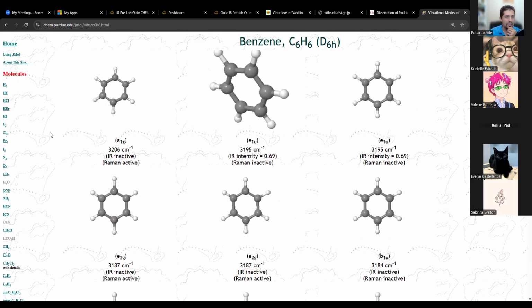It says, does sample phase affect what the spectra looks like, difference in peaks? Sometimes it does, sometimes it doesn't. For example, we're going to see that hydrogen bonding, which happens in liquids, can change the vibrational frequency of the compounds and the bonds. That would be a cool experiment, right? Take an IR spectrum of water in the form of ice and take an IR spectrum of water in the form of liquid and then see if they're the same. That's actually an interesting question. As far as I know, there shouldn't be too much of a change if it's a powder or if it's a liquid. But in general, we usually take IRs of solids. Good question. I'll look more into that and I'll have a better answer for you next week.